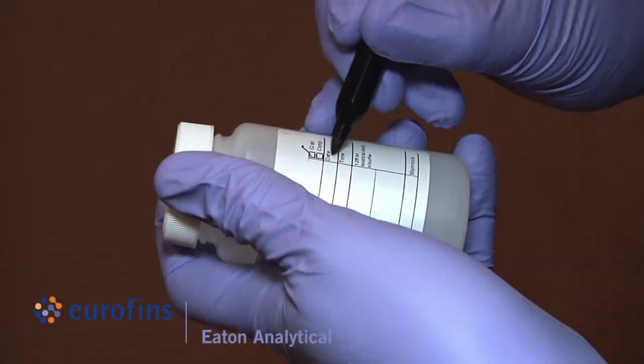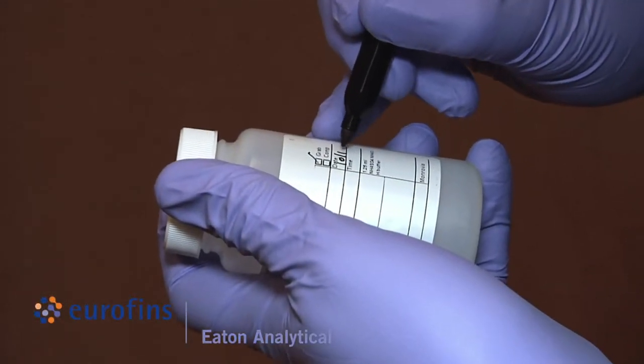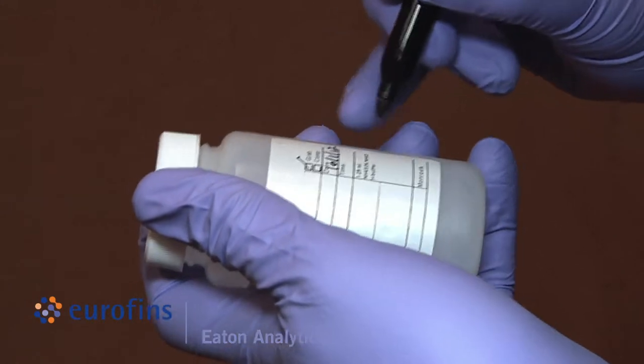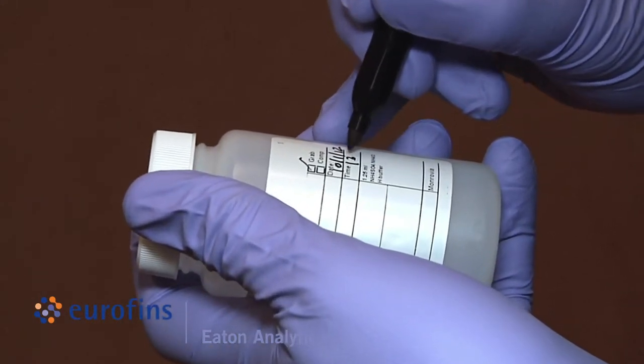Before filling, label the bottles with required information that is not already pre-printed such as the sample ID, date, and time of collection.